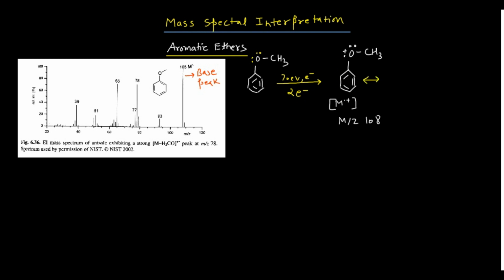So I am moving my electrons. One of the electrons will come down, and this bond will break. One electron will shift over there, and the other electron will come here. Then you will end up with a new species that looks like this: a double bond now, this is oxygen with a positive charge, 2 lone pairs, one lone pair is already there, and this odd electron is present here, and these 2 bonds remain the same.